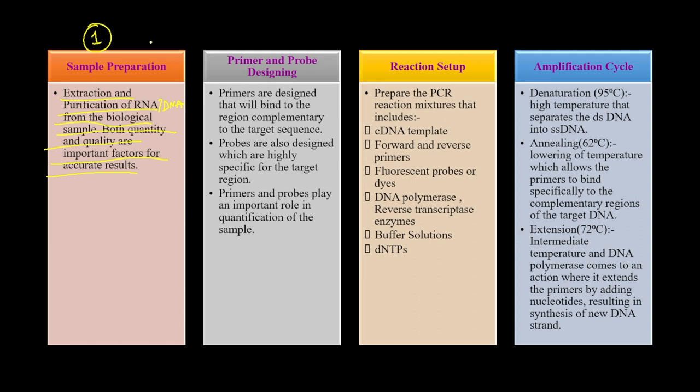Once that part is done and you have cleared the QC part, that is, you have passed the quality control, then you are going to have the primers and the probe designing. The primers are designed that will bind to the region complementary to the target sequence. Probes are also designed which are highly specific for the target regions, and the primers and probe play an important role in the quantification of the sample.